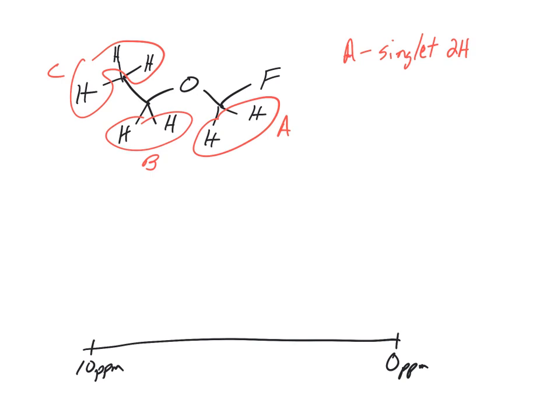So now let's take out one of your sheets that you've been given about NMR. To be able to answer the actual specific, we know this is de-shielded because it's near the electronegative atoms. But the question is, what ppm would it actually be at? So to do that, we actually need to use the sheet. That's going to be a singlet at 6 then. So we'll just say 6 ppm, and it's a singlet, 2 H's, and this was HA.